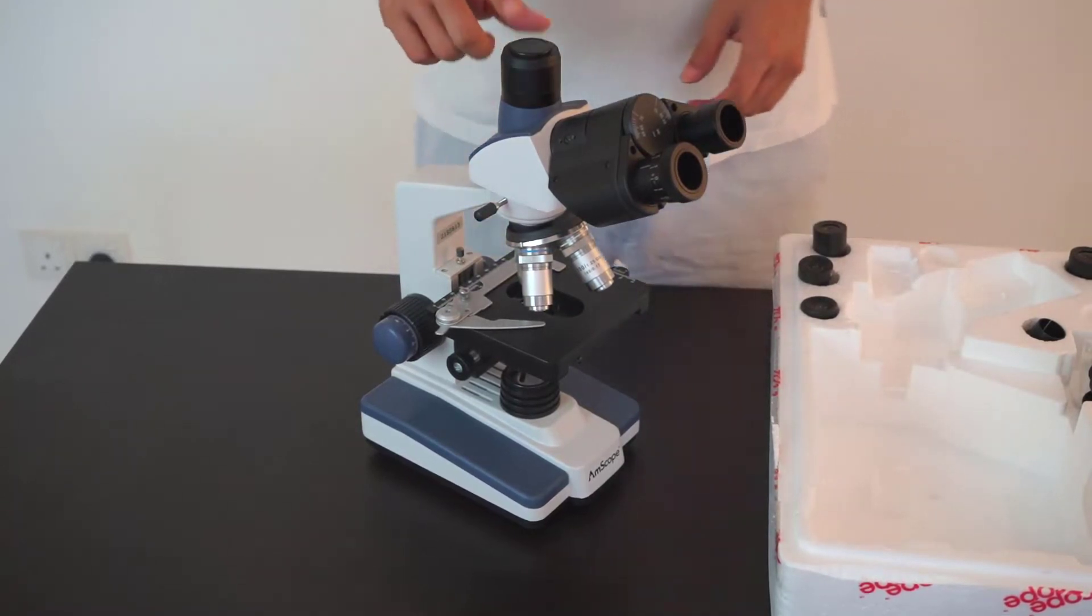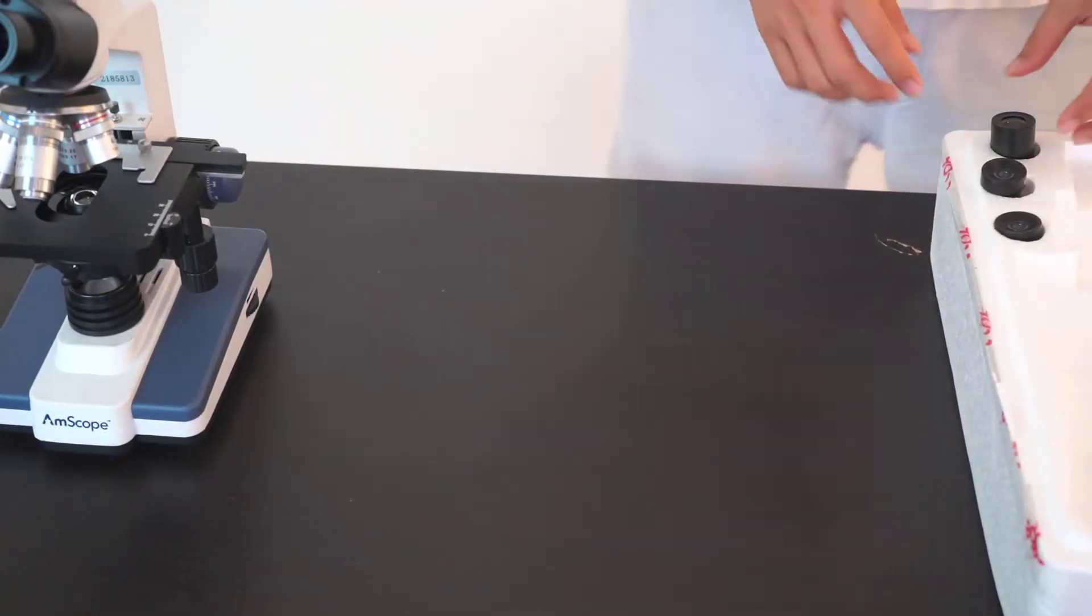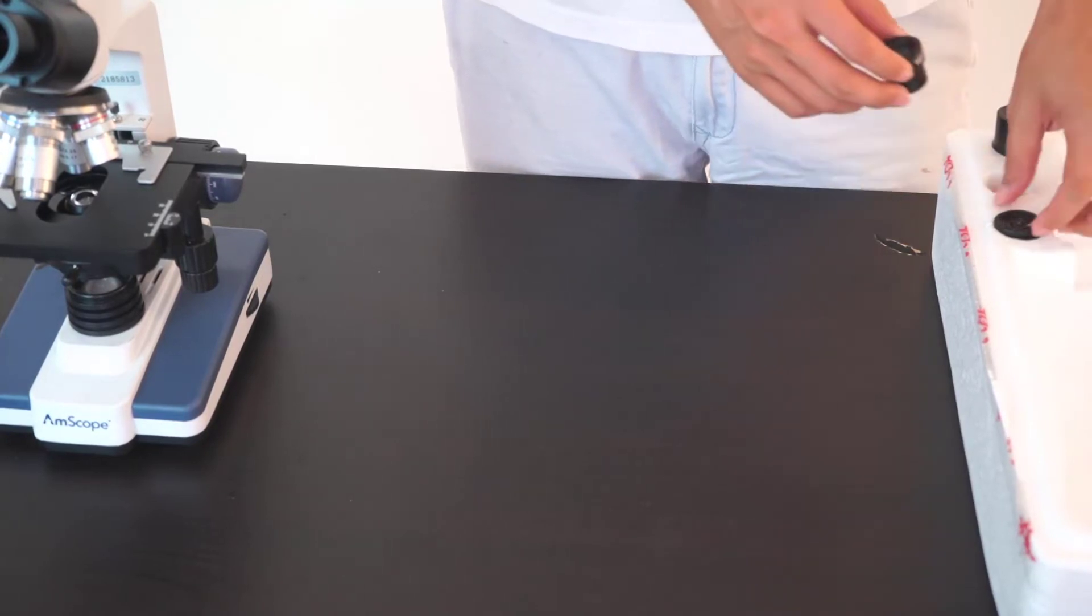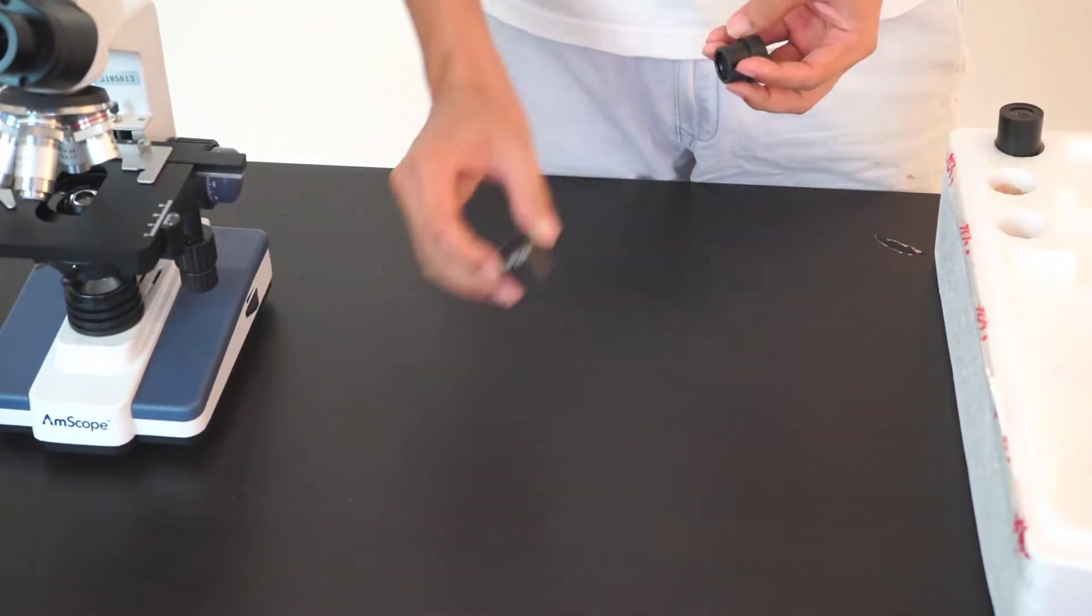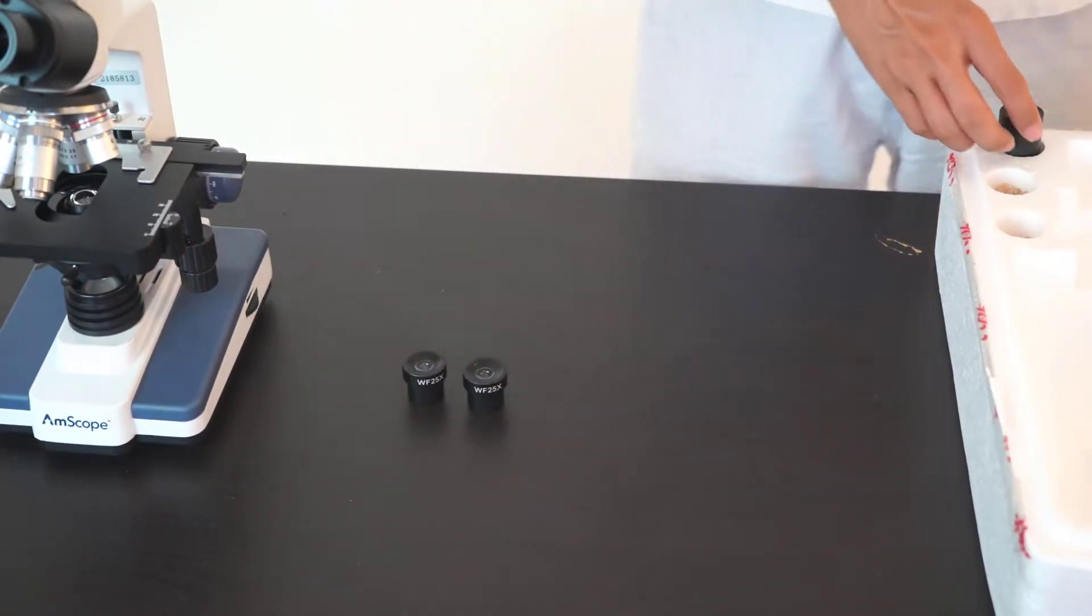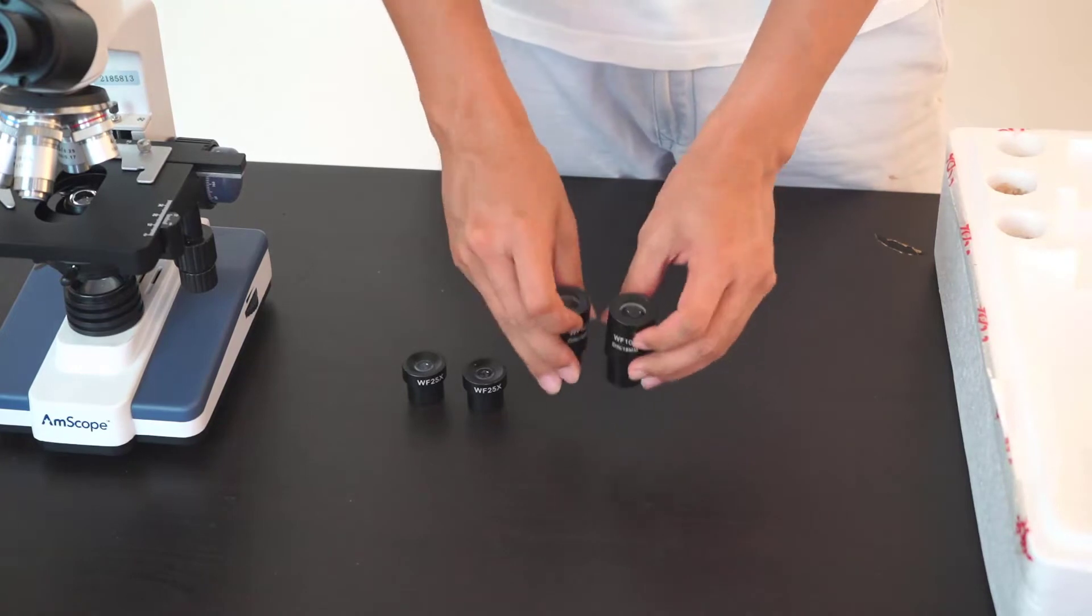This piece comes with a trinocular port. The T120 series comes with different eyepieces - you have a set of 25 times eyepiece and a pair of 10 times eyepiece.